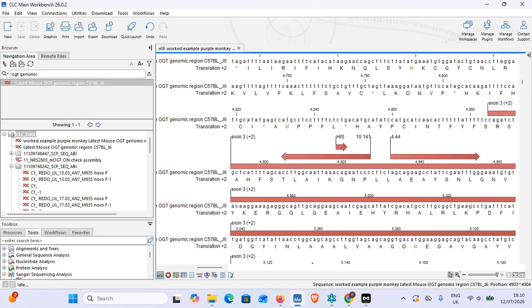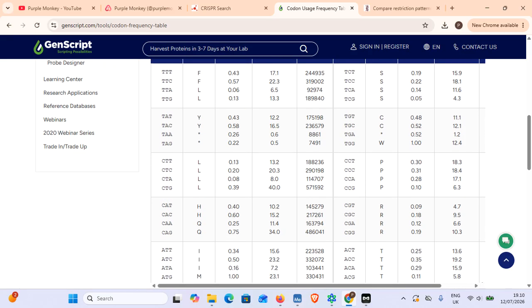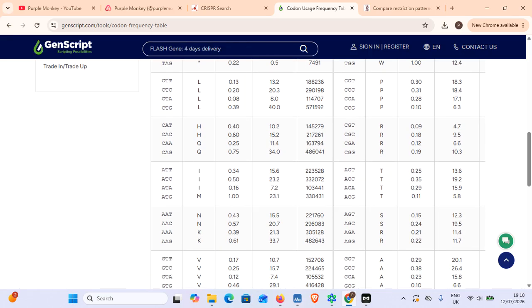So our first one, because here are the C and the C that we want to change: ACC, what are our options? I know this seems like an obvious question, but let's pan down to ACC, which is lurking over here. ACC is actually the most popular at 0.35, but we're going to have to give that one a miss.